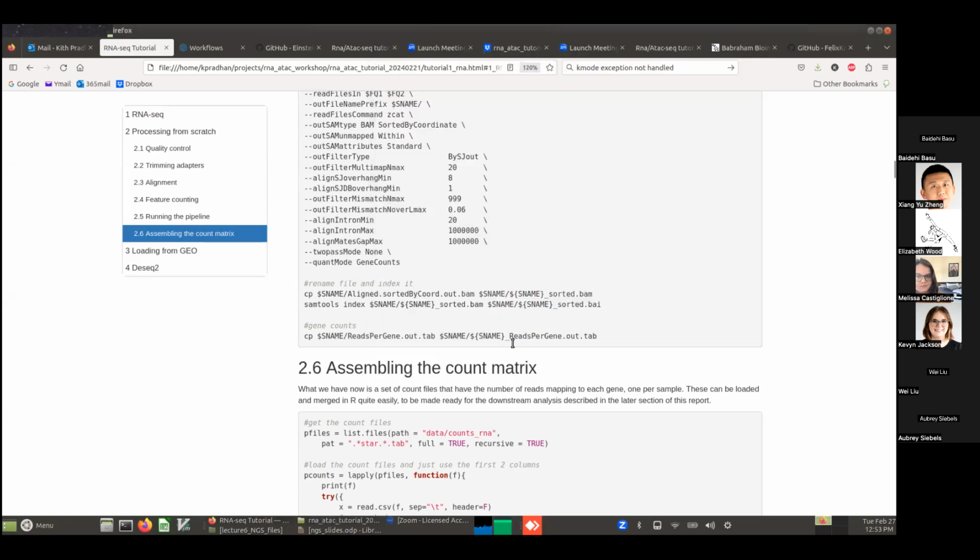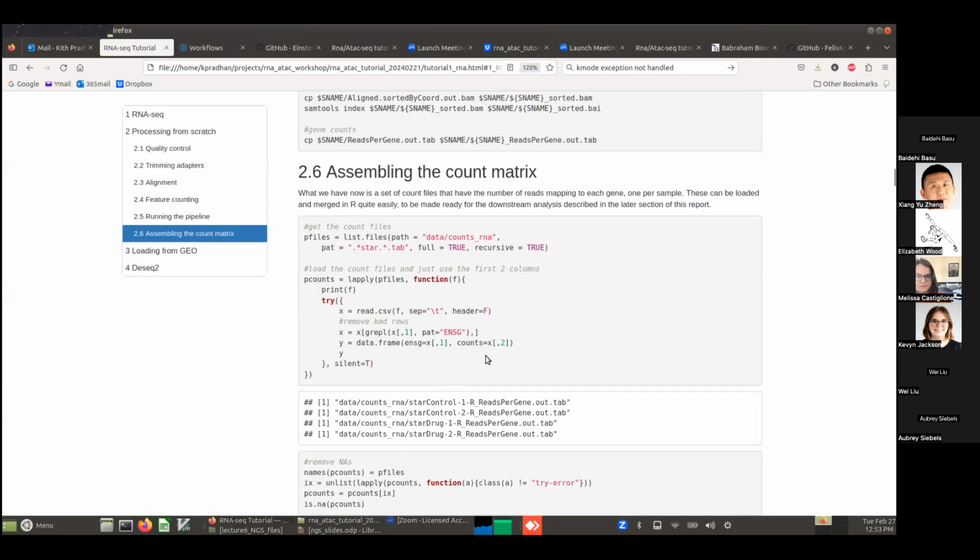So now we'll get to actually, in order, if you wanted to load this up, if you're familiar with R and you've worked with R before, basically you're just loading in text files. You can load those text files, those gene counts in, and process them. Here's some code to do that. If you're not familiar with R, you can even work along and interactively run this code.